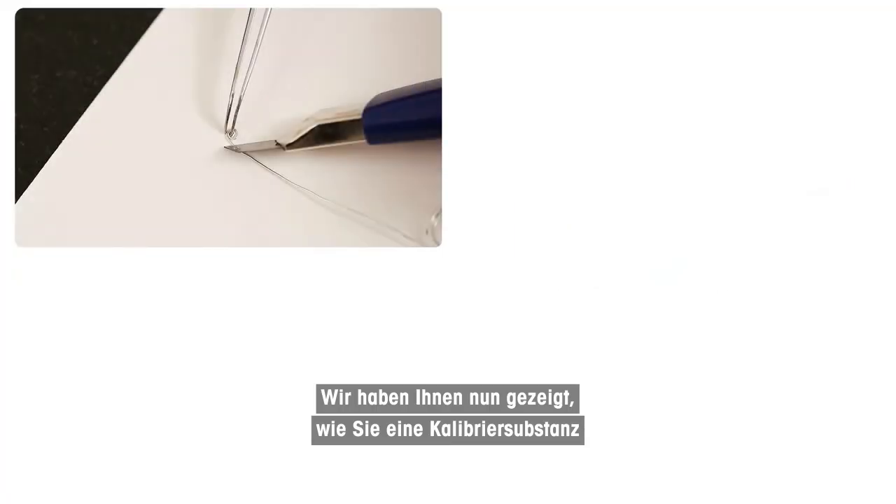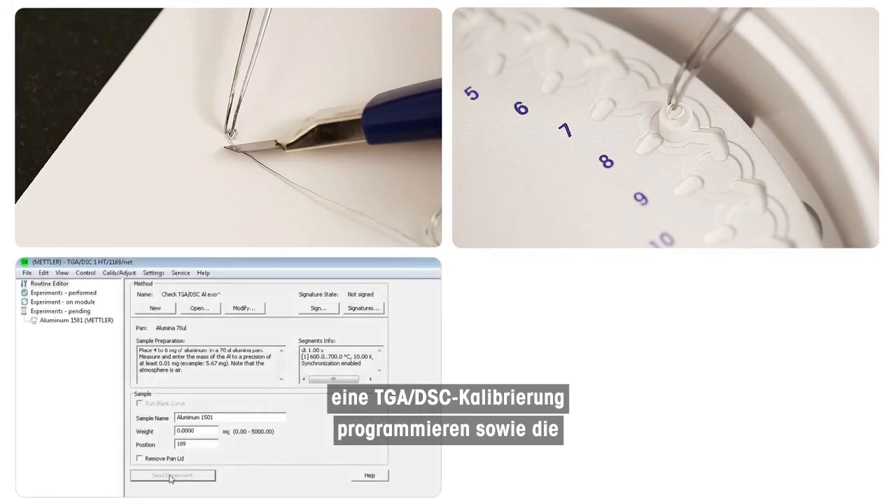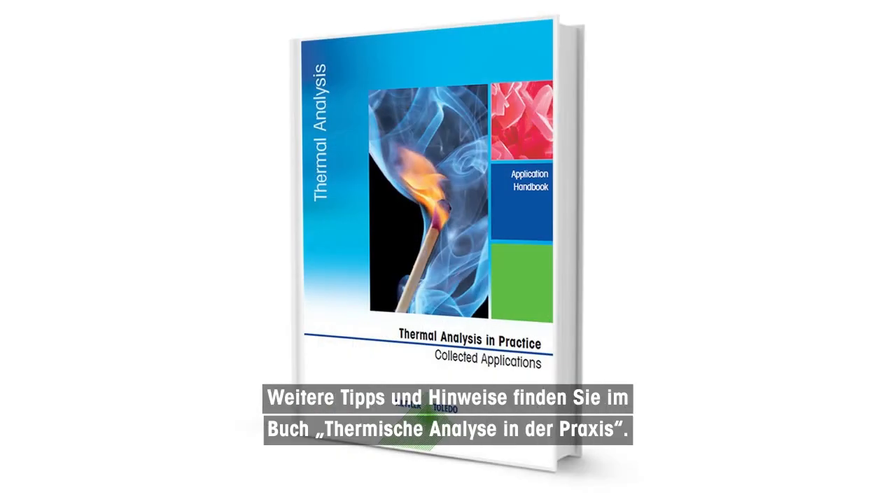We have now shown you how to prepare a calibration substance, how to insert the sample into the TGA DSC, how to program and start a TGA DSC calibration, and the evaluation process of the resulting curve. Further tips and hints can be found in the book Thermal Analysis in Practice.